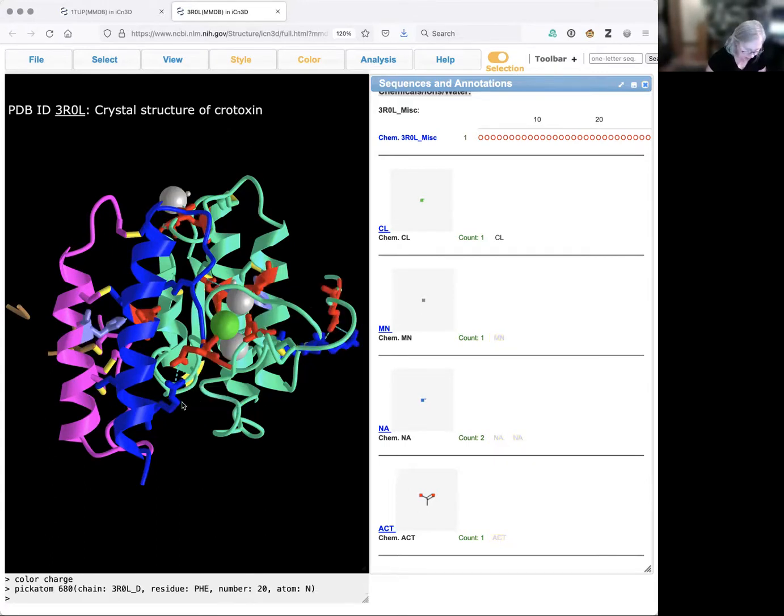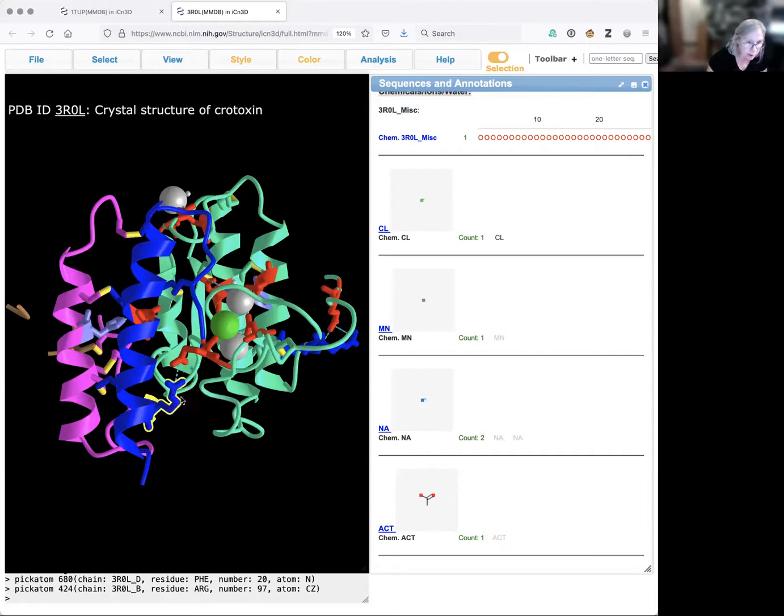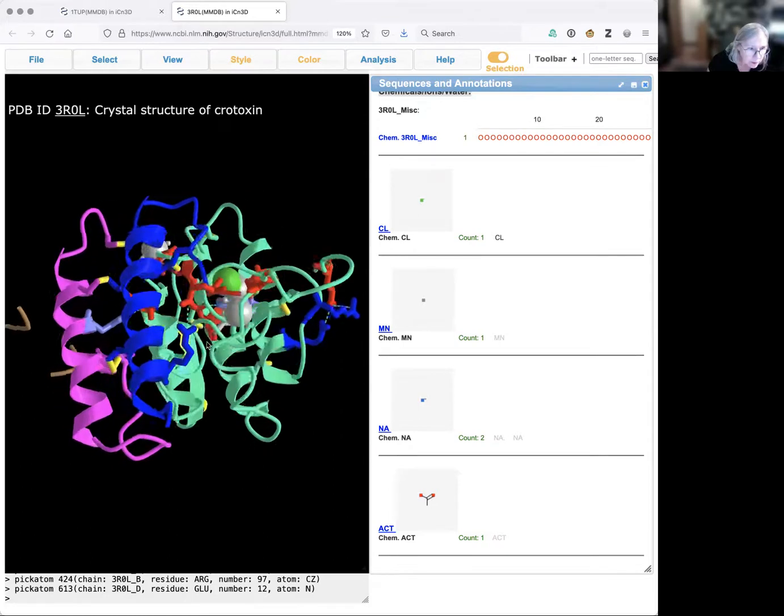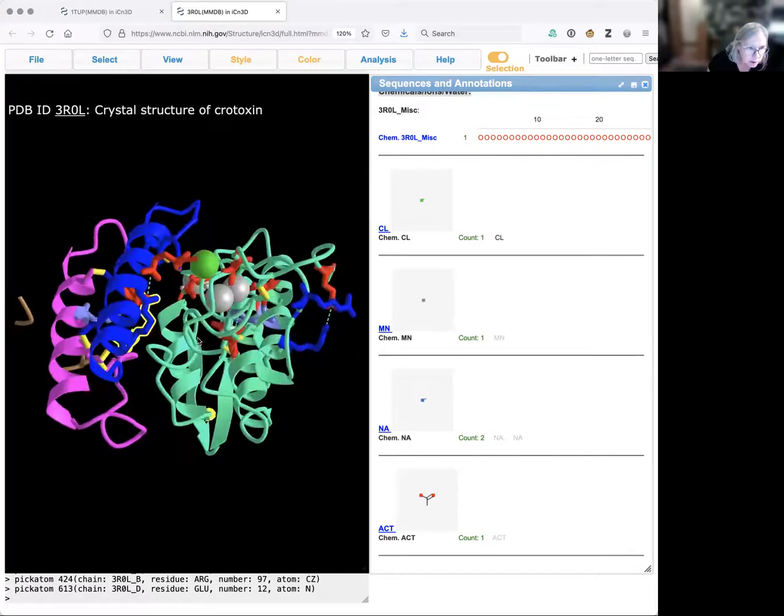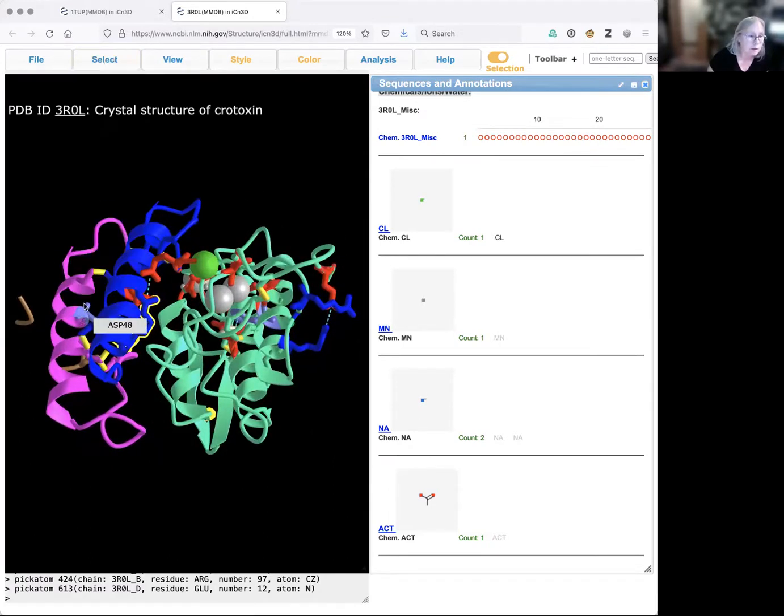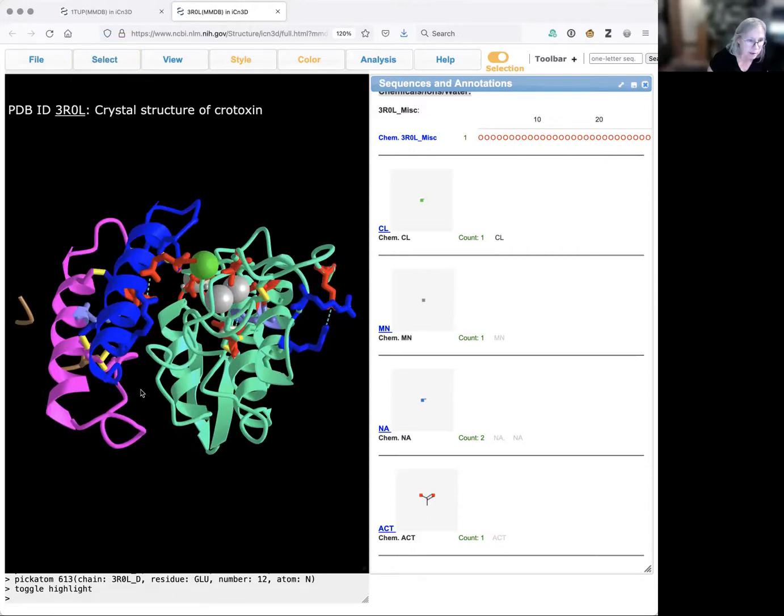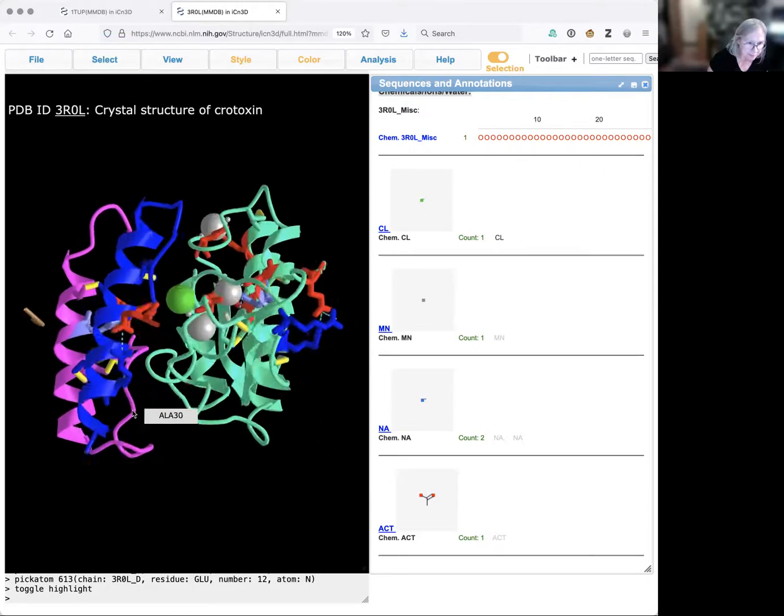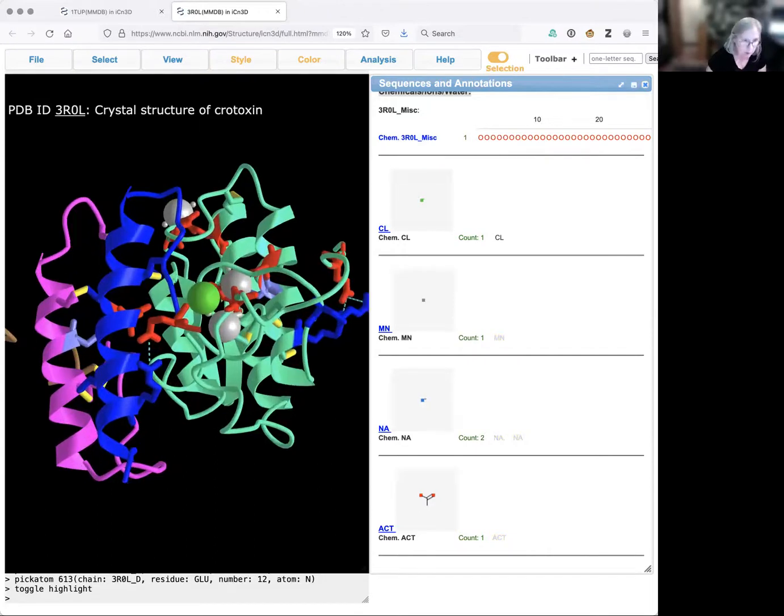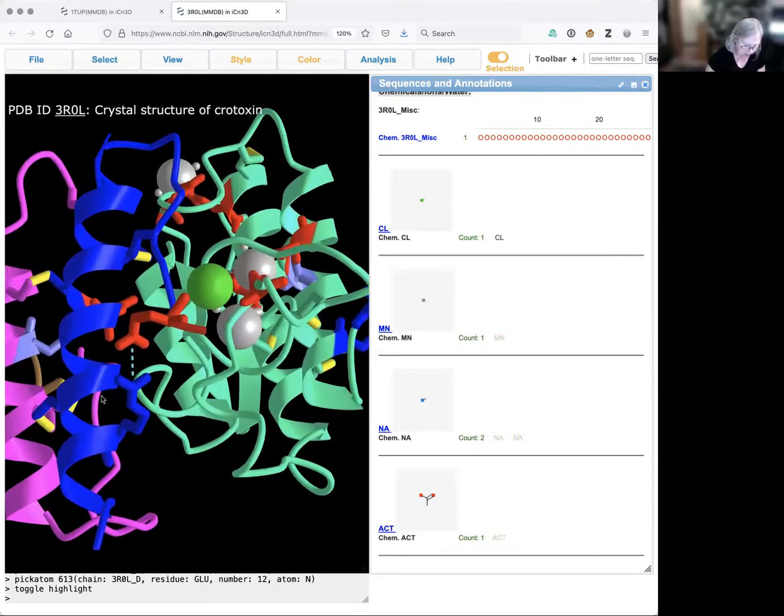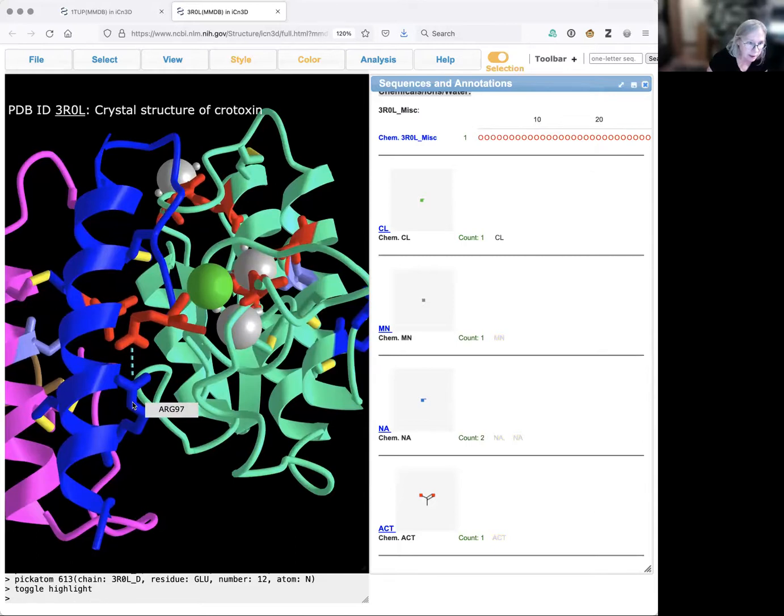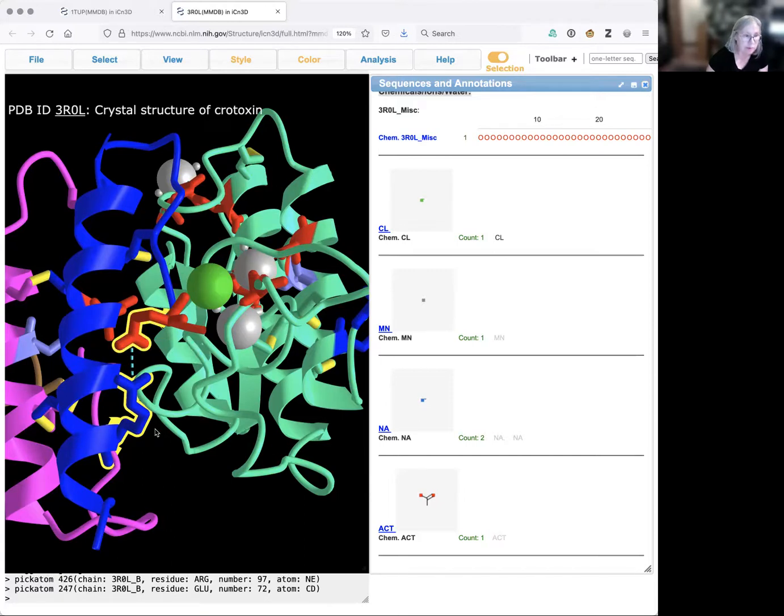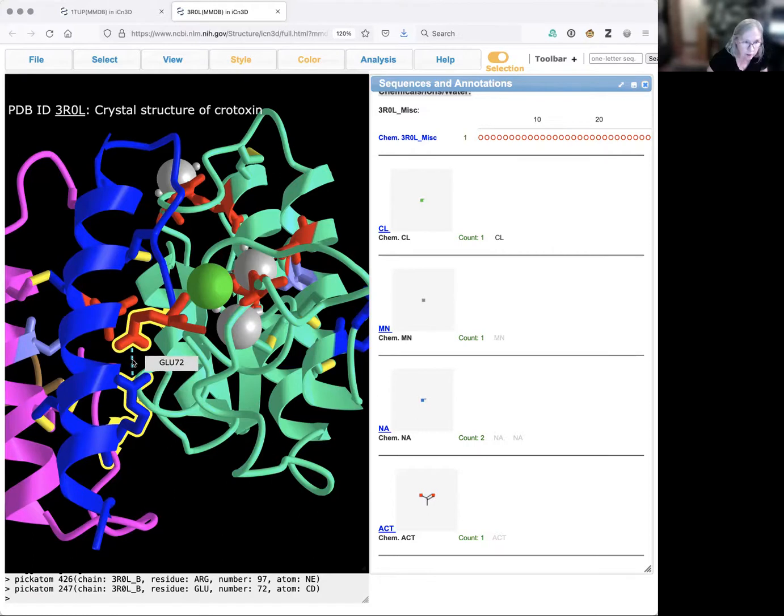I'm clicking option and selecting that arginine. I'm going to toggle the highlight, get rid of my selections, and try this again. I hold the option key down, click arginine. I hold the control key down and I'll click the glutamic acid. Now I've got two amino acids selected and those have got this turquoise bond in between, which is the salt bridge.